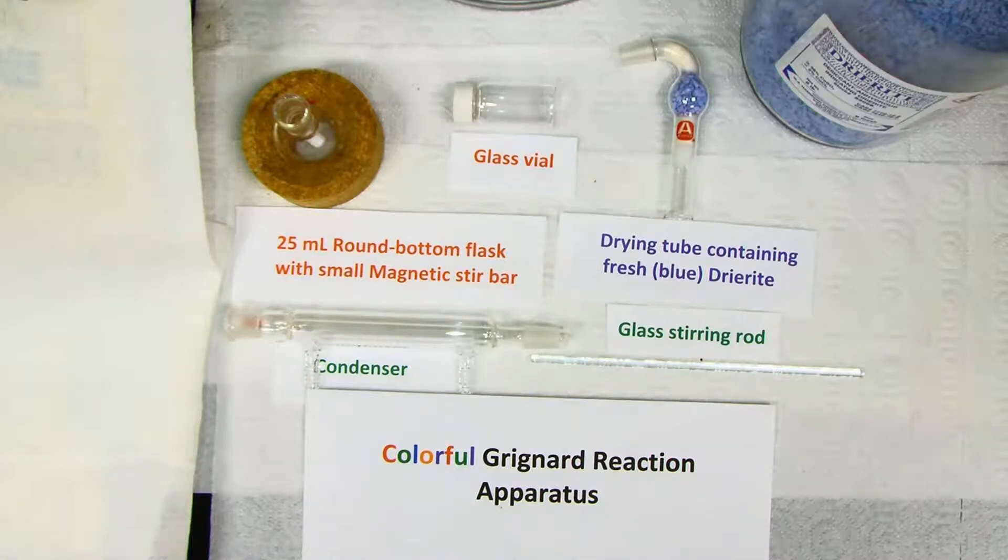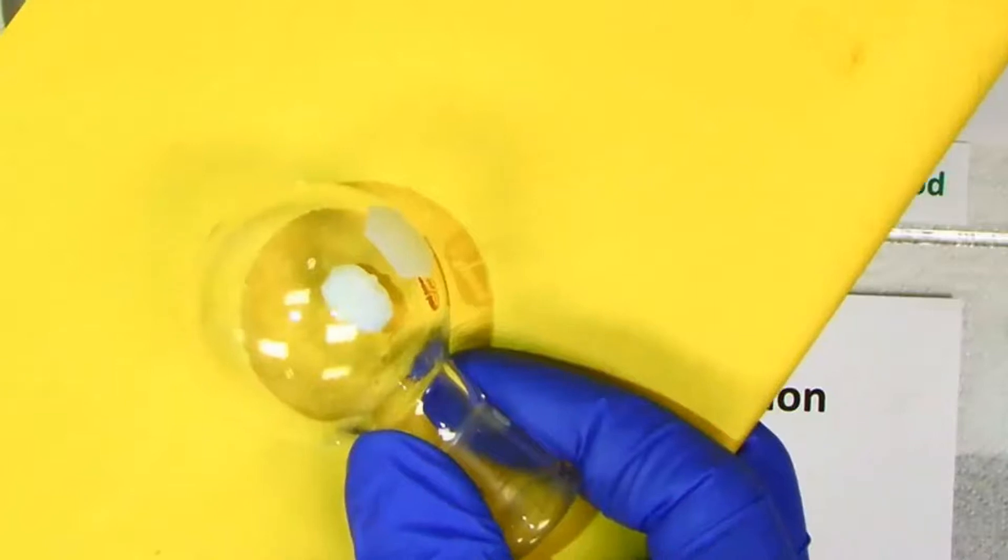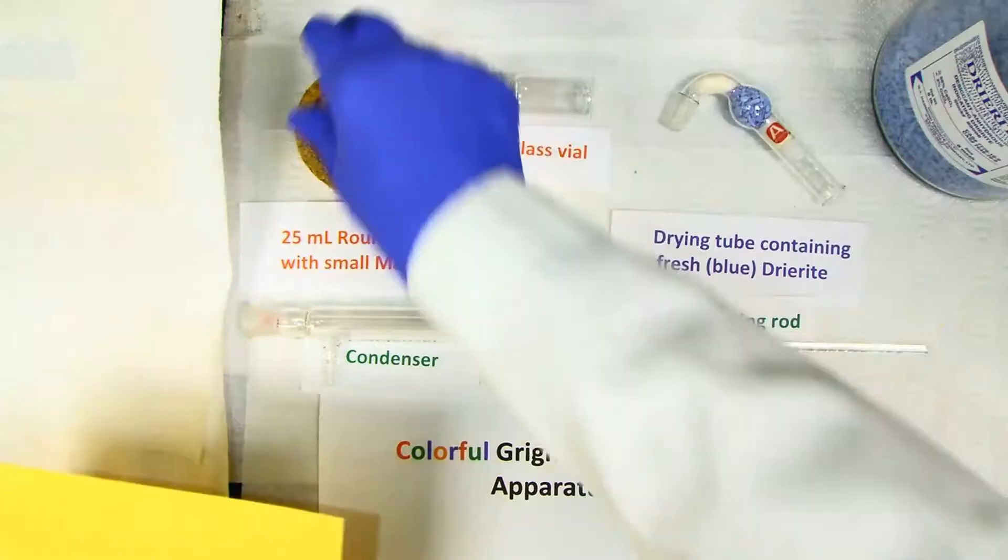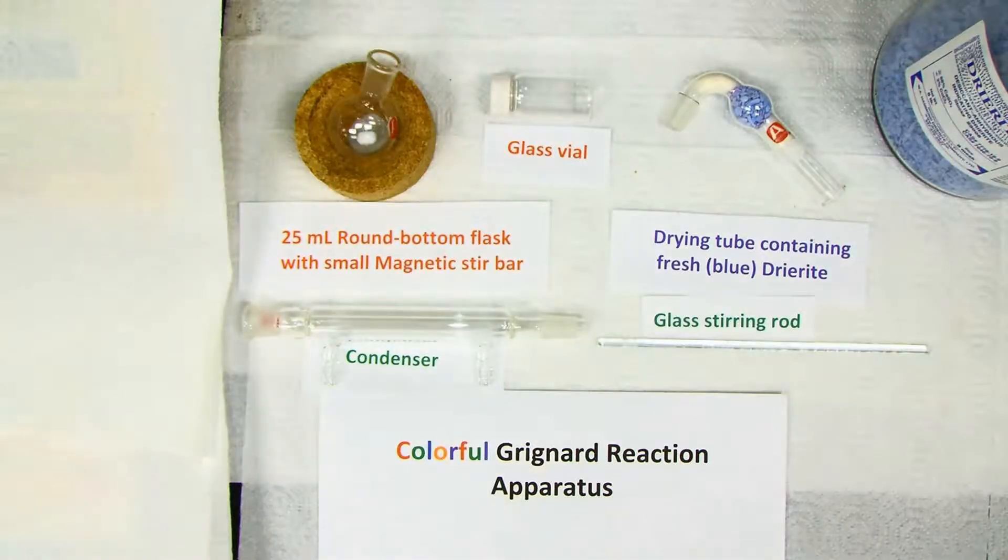The glassware we will use for this reaction is a 25 mL round bottom flask with small magnetic stir bar, the usual condenser, the glass stirring rod, glass vial, and an item you may not have used before: a drying tube containing fresh blue Drierite.